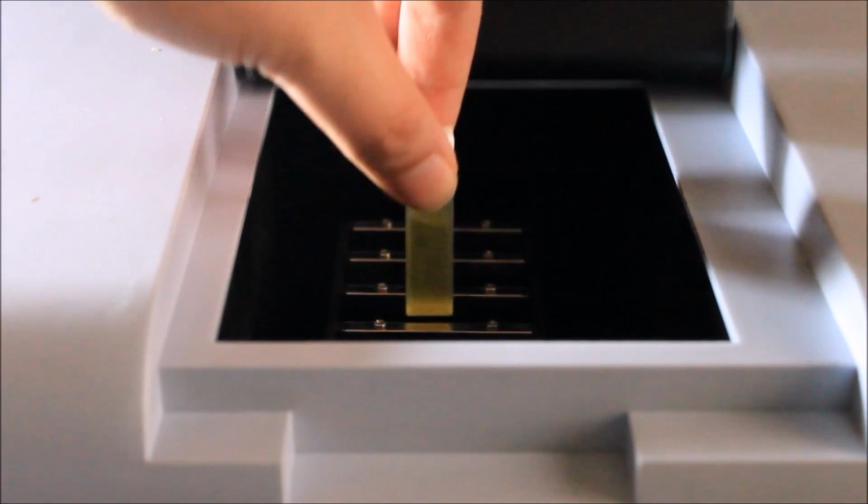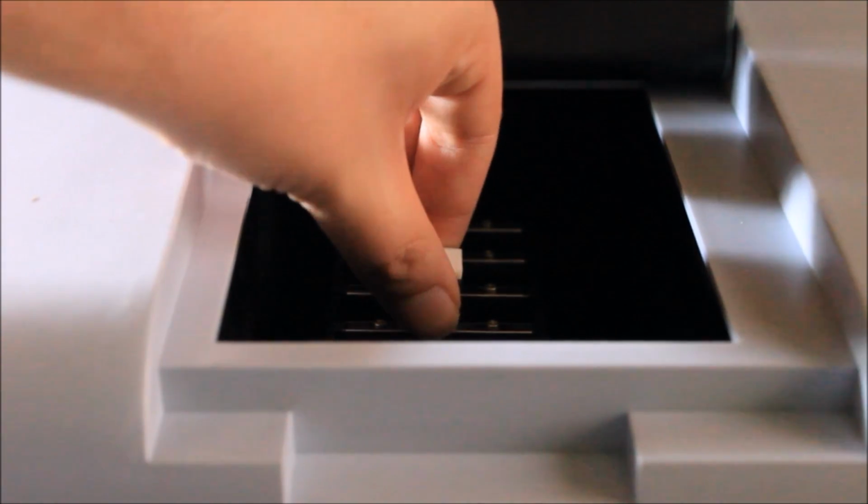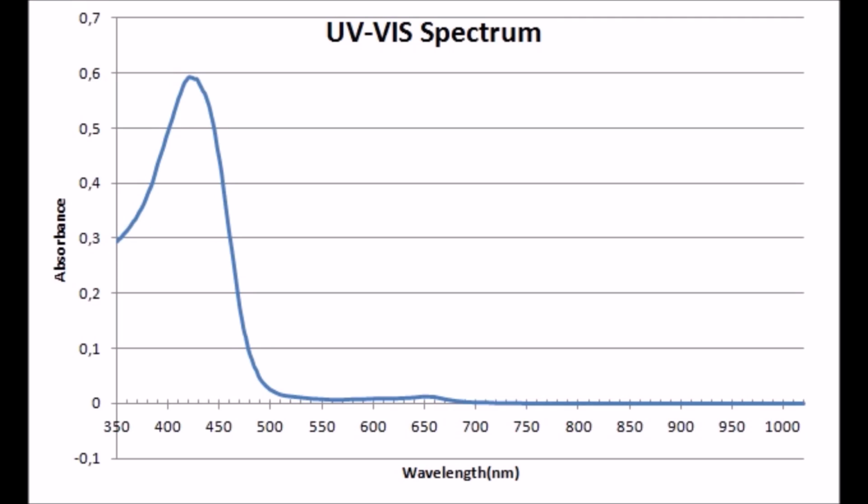The cuvette is then placed in the UV-visible spectrophotometer. The spectrum obtained looked like this. The maximum absorbance was found to be at 420 nanometers, which is in accordance with the curcuminoid absorbance spectrum. Actually, this absorbance corresponds to n to pi antibonding and pi bonding to pi antibonding electron transitions, which is further shifted to lower frequencies due to extended conjugation.